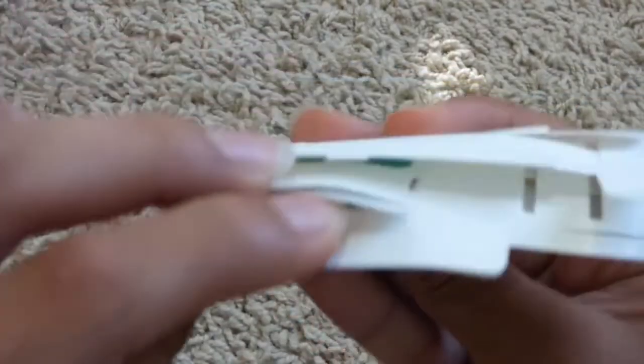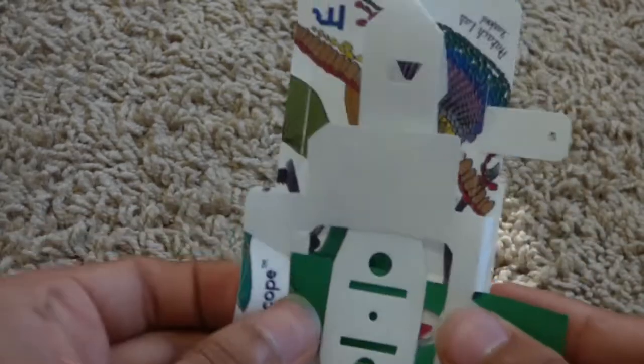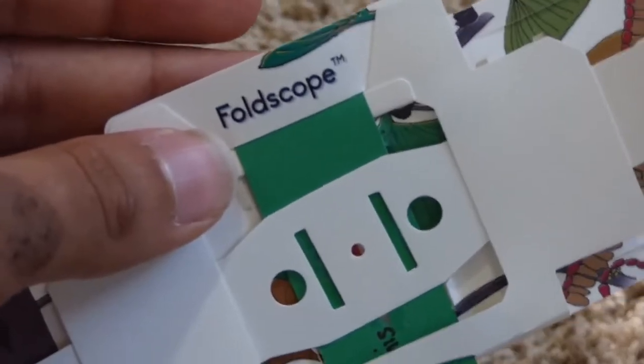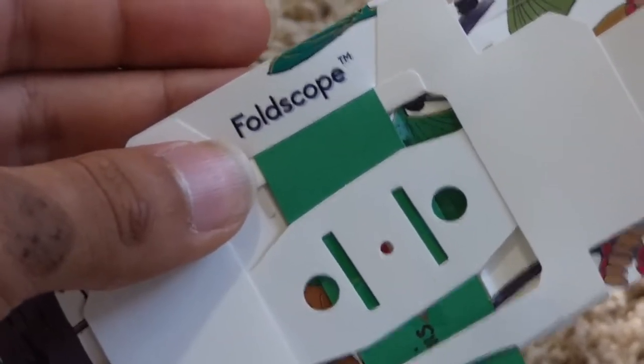I'm going to open it up from this side so it becomes a little bit easier for us to understand where to put our Foldscope slide. I now notice that we can see the little pink area of our slide. This is where we can focus it and position it a little bit for a clearer image when we're looking at it underneath the microscope.